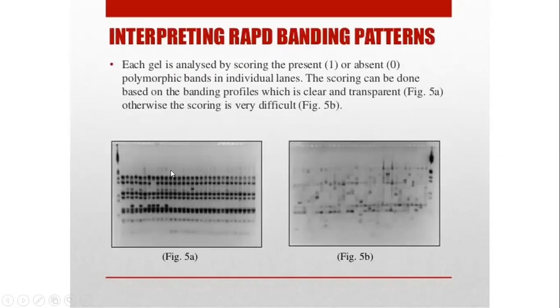One more important point: the same RAPD technology is used to generate gels, and if he is a supervisor or principal investigator who has big experience in this PCR, his gel looks like that. But if the same procedure and same primers are given to a starting undergraduate in the lab, he will do the same experiment, and his gel looks like this. We cannot blame the guy.